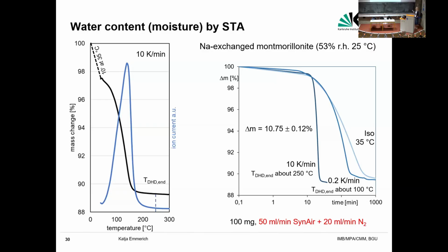And then it's also possible to determine the water content at room temperature. But you have to make sure that you lower the partial pressure of the water vapor sufficiently. And commonly, when you determine the water content in an oven in your lab, you neither apply vacuum nor streaming dry gas. Yeah? And then you always have remaining water molecules in the oven from the atmosphere, and that's why 105 or 110 degrees Celsius are not sufficient to determine the water content of swellable clays.